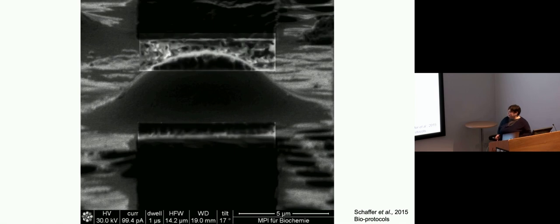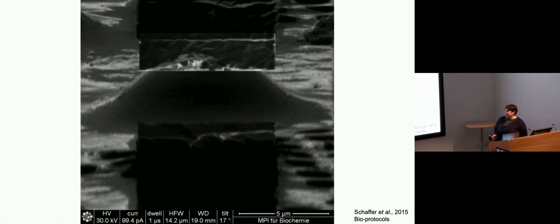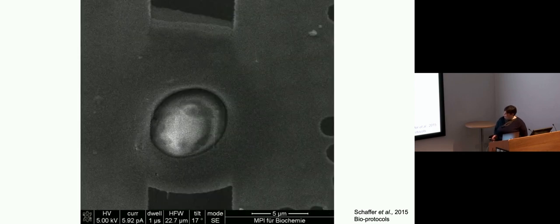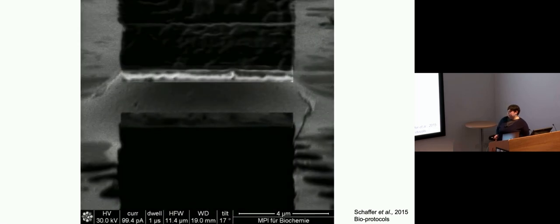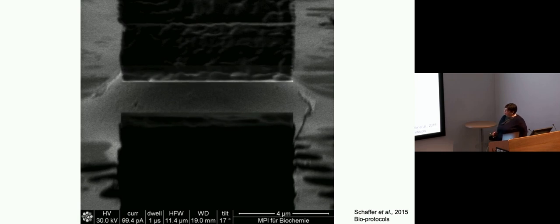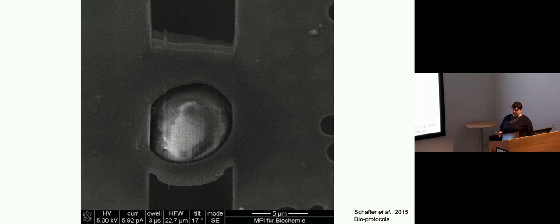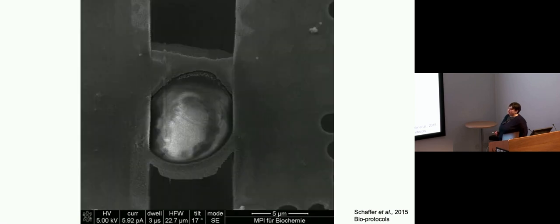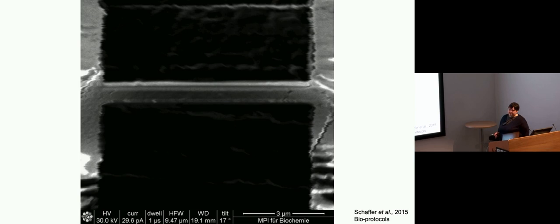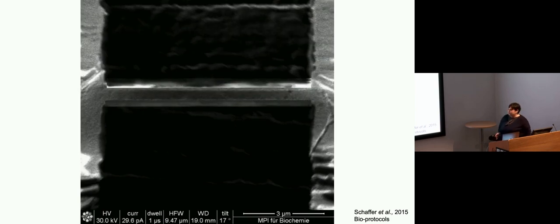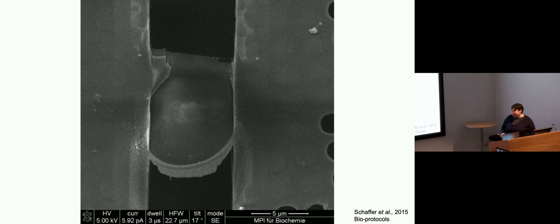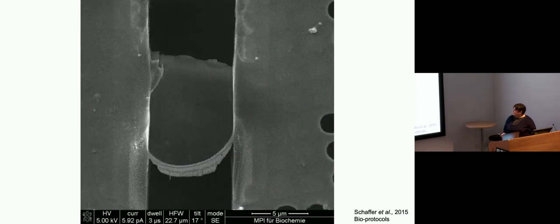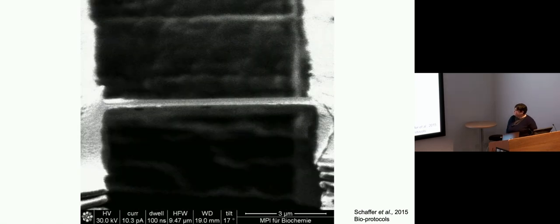Then the next step is coming back to the ion beam, setting new areas, milling through again. If you note down here, you'll see that the beam currents are progressively going down as we mill. Now in the SEM, you can see the top of the cell has come off. This process tends to be iterative, doing several steps of milling. Normally, you wouldn't necessarily go and image every time between, but this is just for illustrative purposes. Until gradually, it gets thinner and thinner. That's the final.